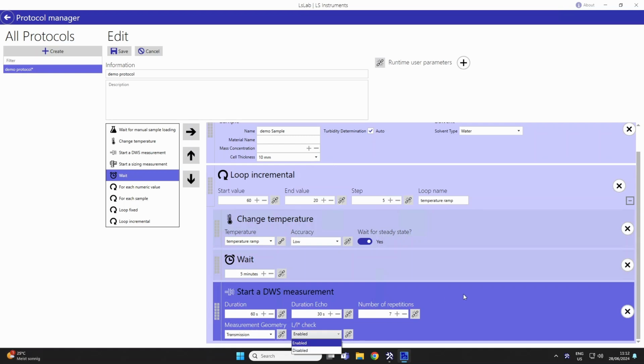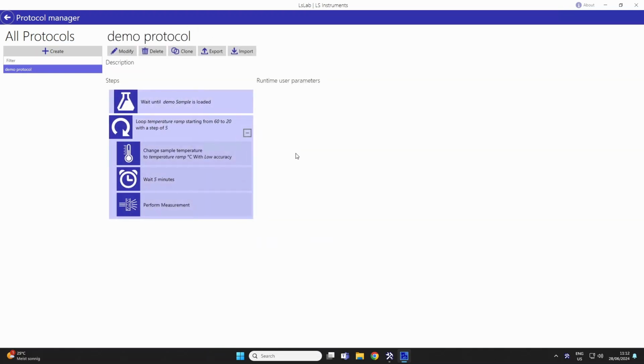After saving the protocol, you will see your created protocol again in a more compact view. You can make sure everything is correctly defined and if all the functions that need to be inside of the loop are actually part of the loop. All functions outside the loop will be spaced by the white background, while all functions within the loop will have a blue background.